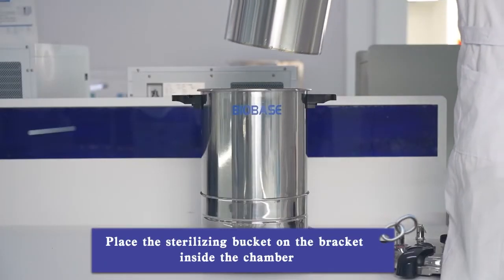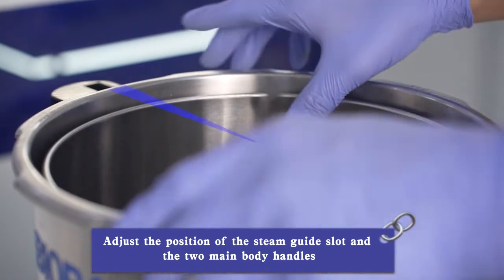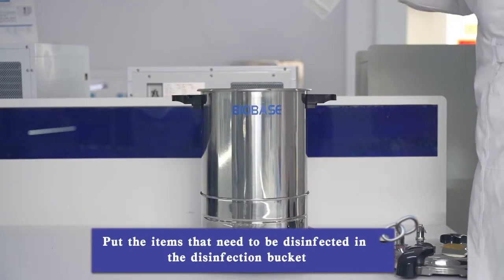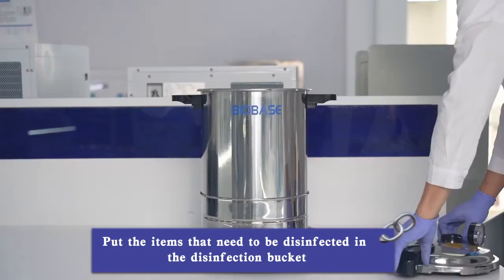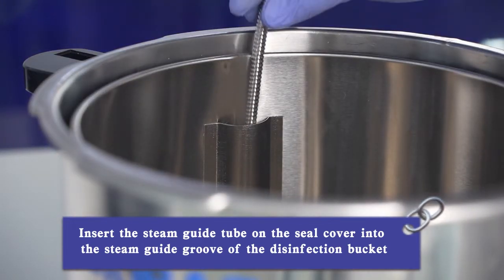Place the sterilizing bucket on the bracket inside the chamber. Adjust the position of the steam guide slot and the two main body handles so that the connected straight lines form an angle of 30 degrees. Put the items that need to be disinfected in the disinfection bucket. Insert the steam guide tube on the seal cover into the steam guide groove of the disinfection bucket.